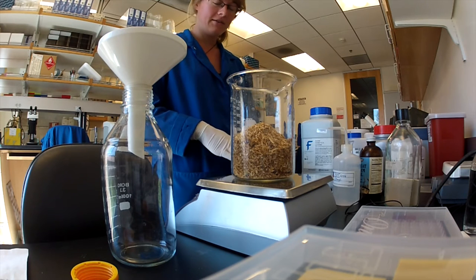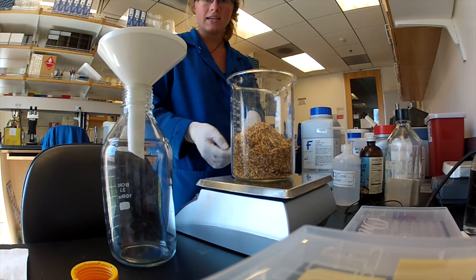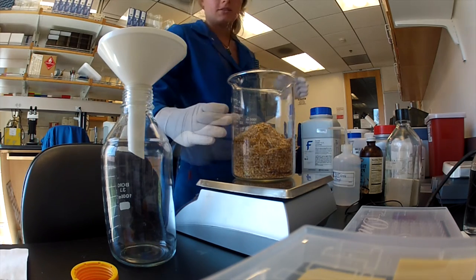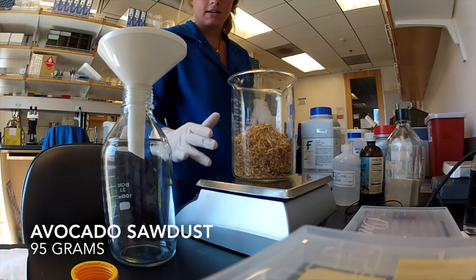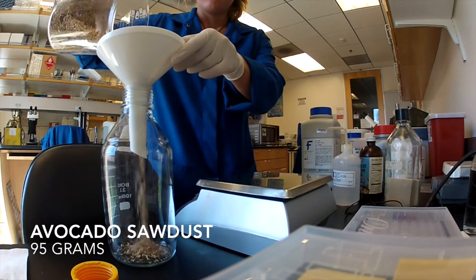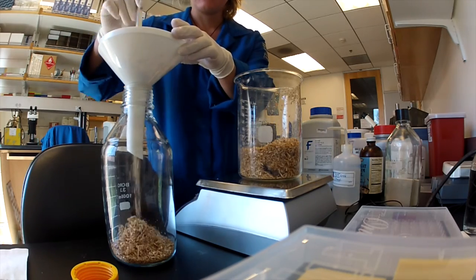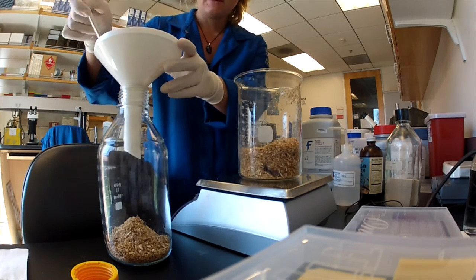I'm going to be weighing out ingredients using a simple kitchen scale and then combining them inside a 1-liter autoclavable flask. To start, we have 95 grams of avocado sawdust. We keep our excess sawdust in a negative 20 degree freezer to prevent the growth of mold or other contaminants.